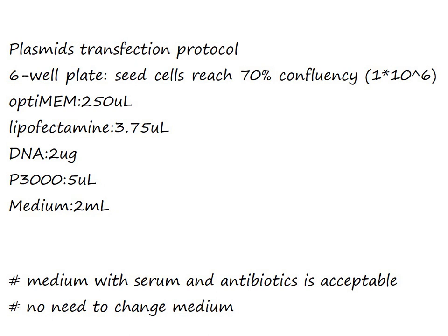Sometimes the cells are vulnerable and sensitive to the toxicity of the liposome-mediated transfection. You can use medium without antibiotics during DNA lipid incubation with Opti-MEM for 6 hours and then change back to the complete medium. Sometimes serum starvation before transfection and serum-free medium during transfection help to improve the transfection efficiency.